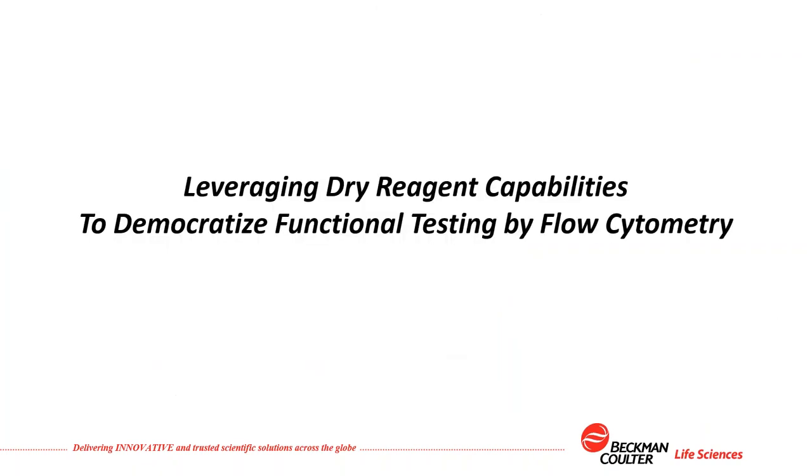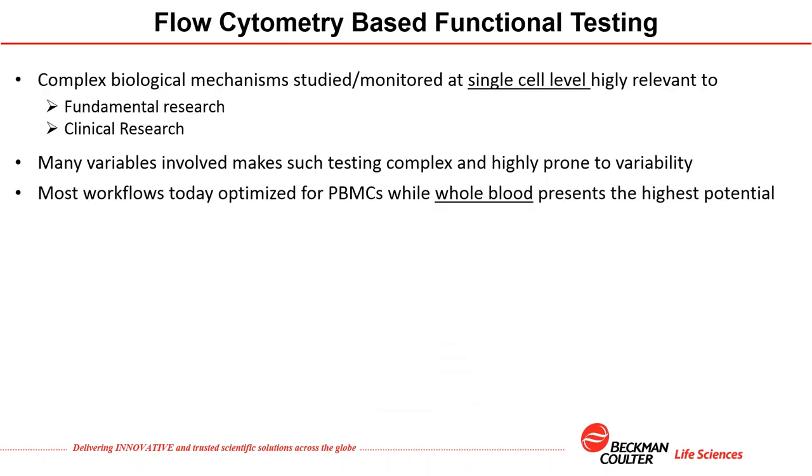So now we can go more into the details of why we believe in, and what we are trying to do to bring, further functional testing by flow cytometry. There are many reasons for that, but first of all, we have to realize that this kind of functional flow cytometry is a really powerful approach to gather really important insights into a complex biological system that can be useful not only for fundamental research, but clinical research also down the road.